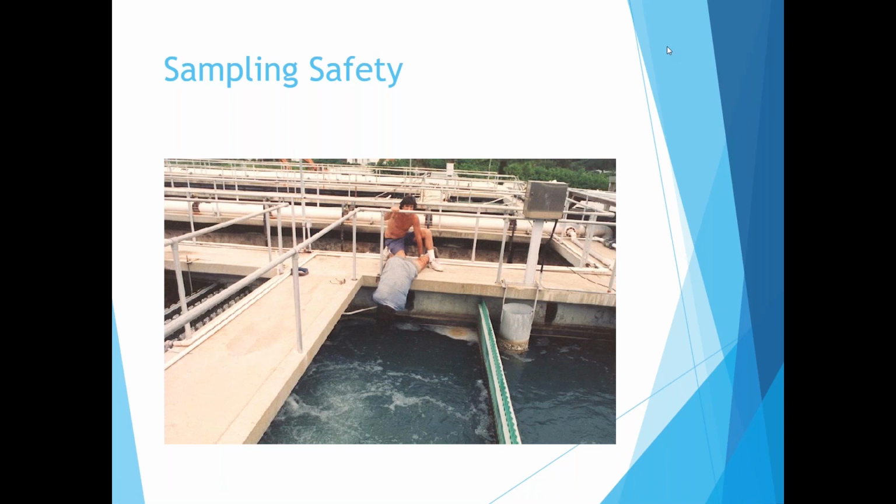That's clever. One follow-up to that, I'm noticing somewhat related. It says for automatic sampler, do you accept the NIST thermometer in a bottle of water to verify the temperature that the sample is maintained at? Do you accept the thermometer reading of only the air temperature? So you can read air temperature or water temperature. It doesn't matter. The problem with air temperature is, let's say I go in and I open it up and I pull it out and somebody asks me a question. Well, that is going to heat up faster than if it was in a bottle of water or a bottle of alcohol.